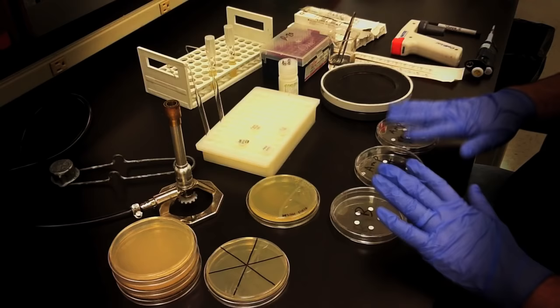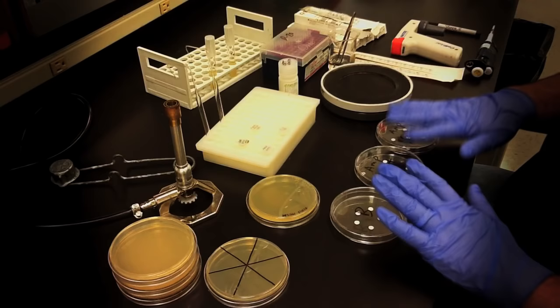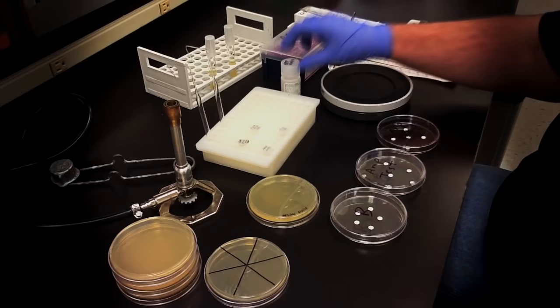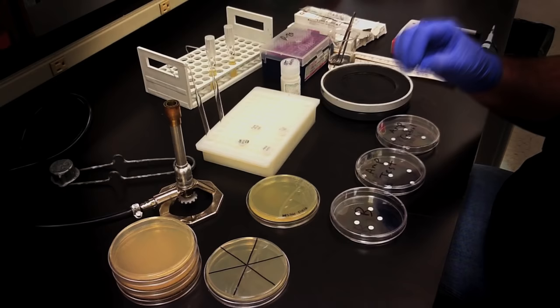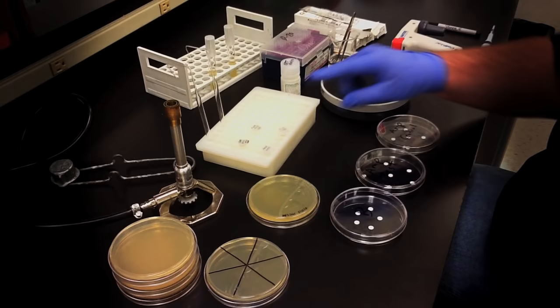While your cultures are growing out, you can make up your antibiotic test discs. For testing out an antibiotic powder, start with a fresh solution of each antibiotic being tested and then dilute them down to the desired concentration. The discs are able to hold about 20 microliters of liquid, and for the ampicillin test, we'll need a final amount of 10 micrograms on the disc. So we'll need a solution with a final concentration of 0.5 mg per mL.